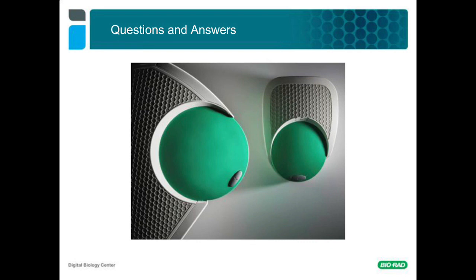Yeah, so that's a great question. We have the publication that I showed earlier in the presentation, and that goes into a lot of really good details. But some of the ways that were used in that paper were using both a TaqMan assay combined with EvaGreen primers. So in one assay there was a probe, and in the other assay there was no probe, and so that's one way that you can use the EvaGreen for multiplexing.